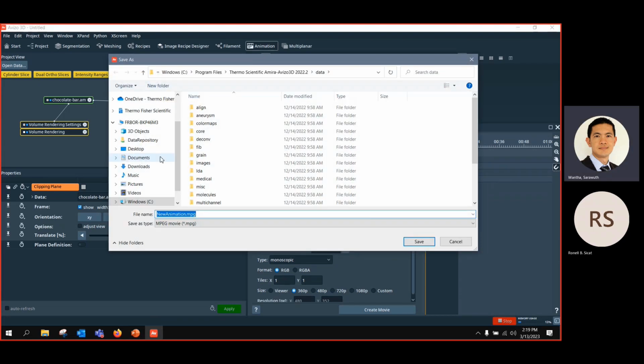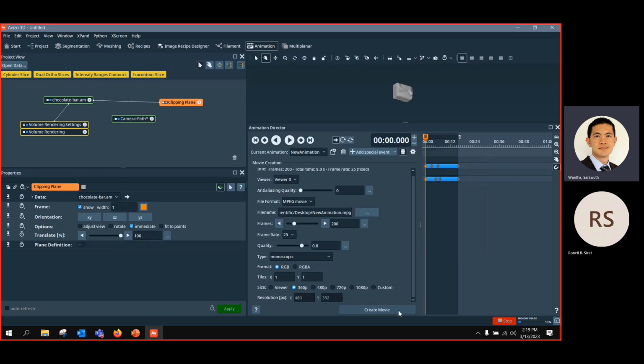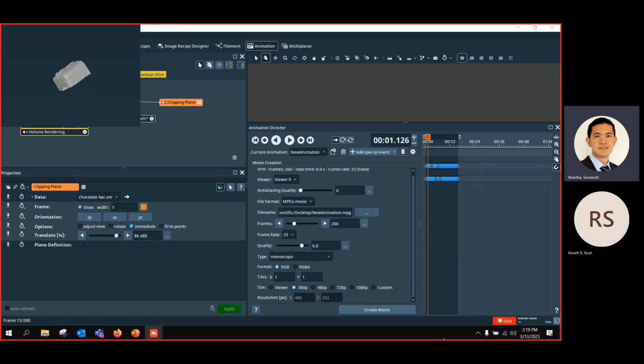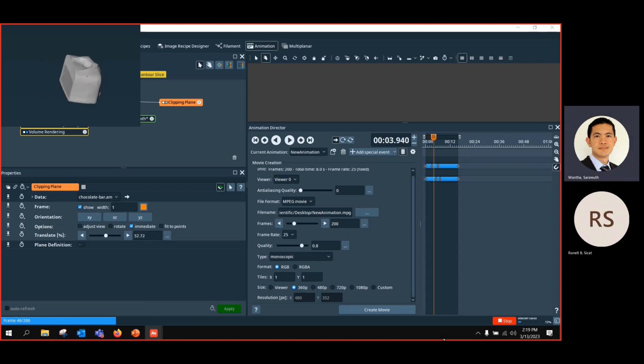Yeah, so I have to select new animation, save, and create movie. And then I start to have this movie. It's created.